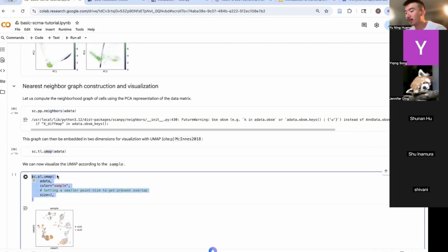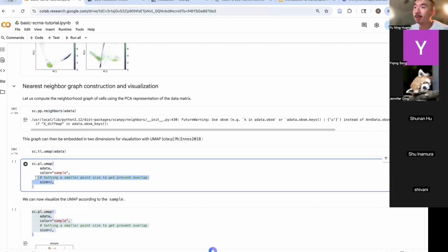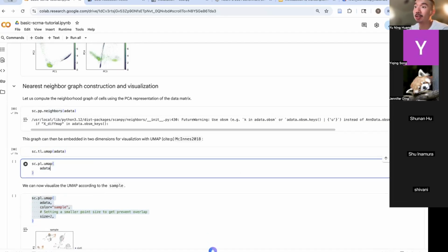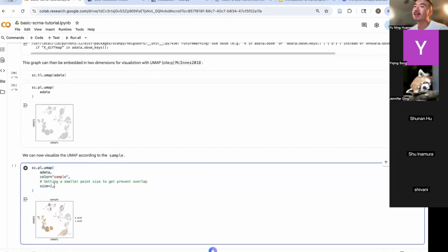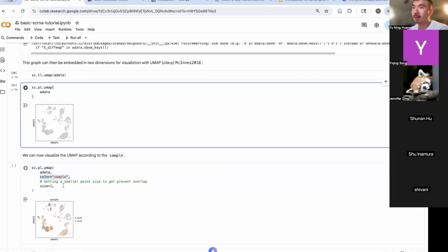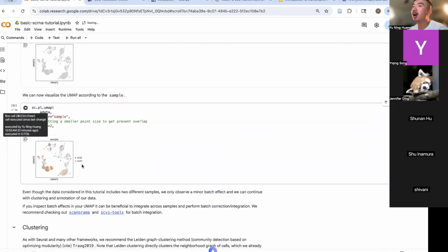And yes. After they calculate, we run the toolkit.umap, we can start plotting the UMAP. So this is a UMAP projection of my single cell RNA-seq data set. And you can just specify the colors you want. So what I did here, I specify the colors, because this is a data set that merged two samples.